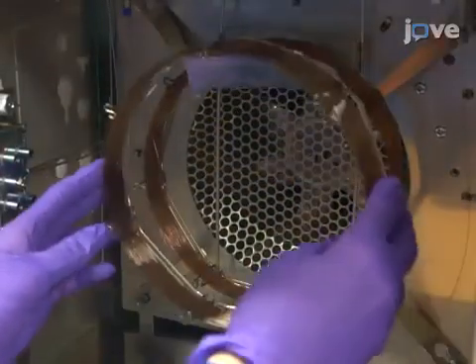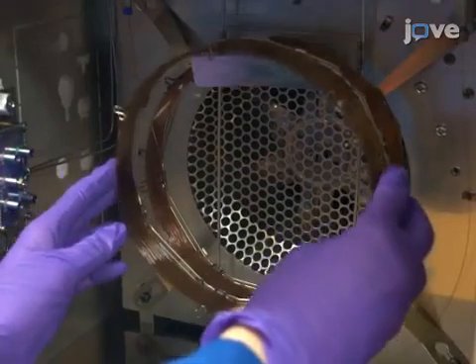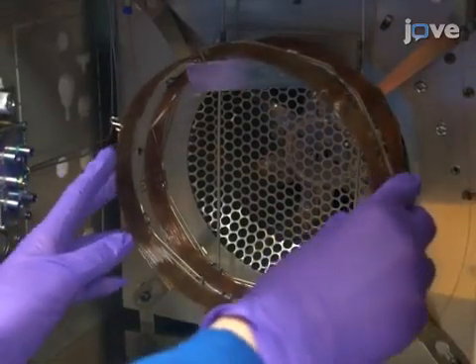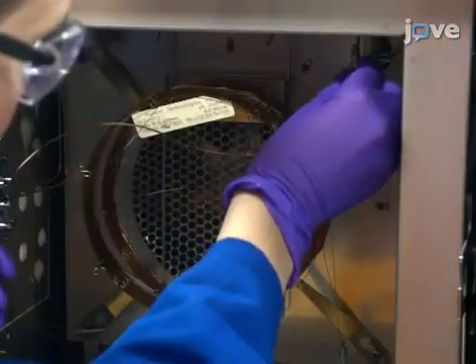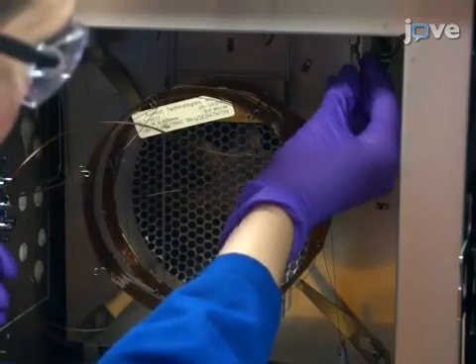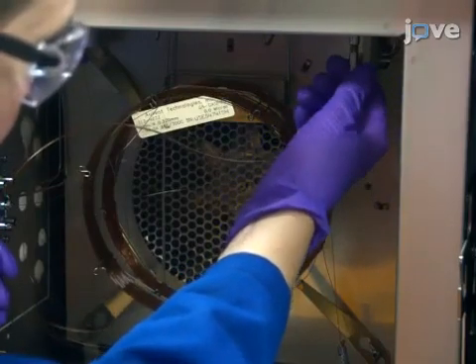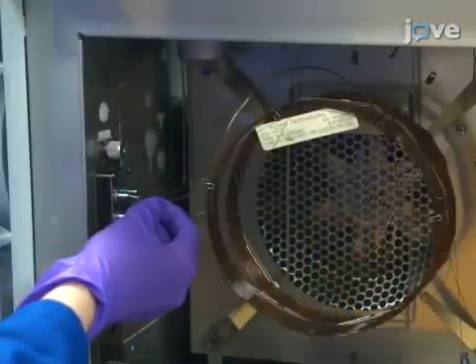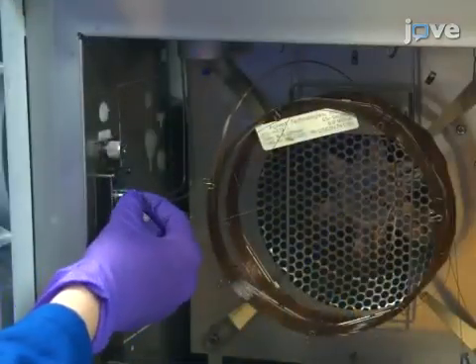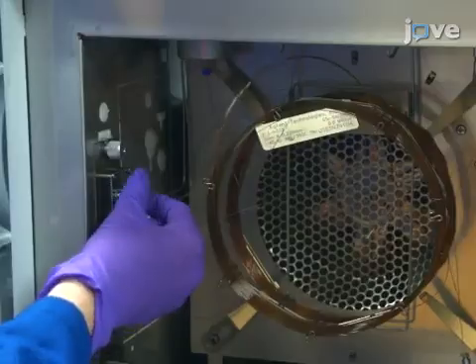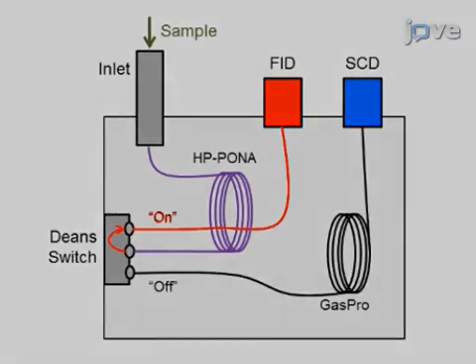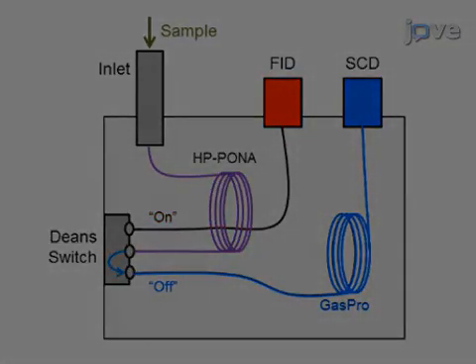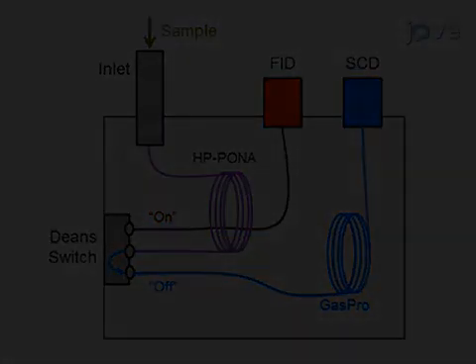Then install the PLOT column between the Dean Switch and the sulfur chemiluminescence detector. Finally, install the restrictor tubing between the Dean Switch and the FID. The Dean Switch is controlled by a valve in the gas chromatograph.